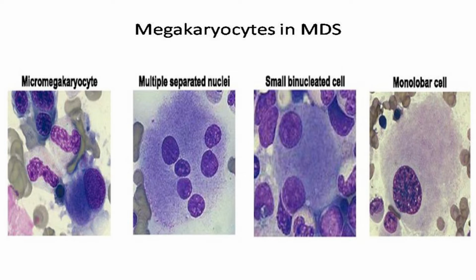So, if a single cell is given to any expert in hematology, can he diagnose this? No, I don't think so. With my experience, it is not possible for anyone. With experience and with the background of the bone marrow aspiration, the type of cases in which this has been done, you presume. That's what I think. I may be wrong.